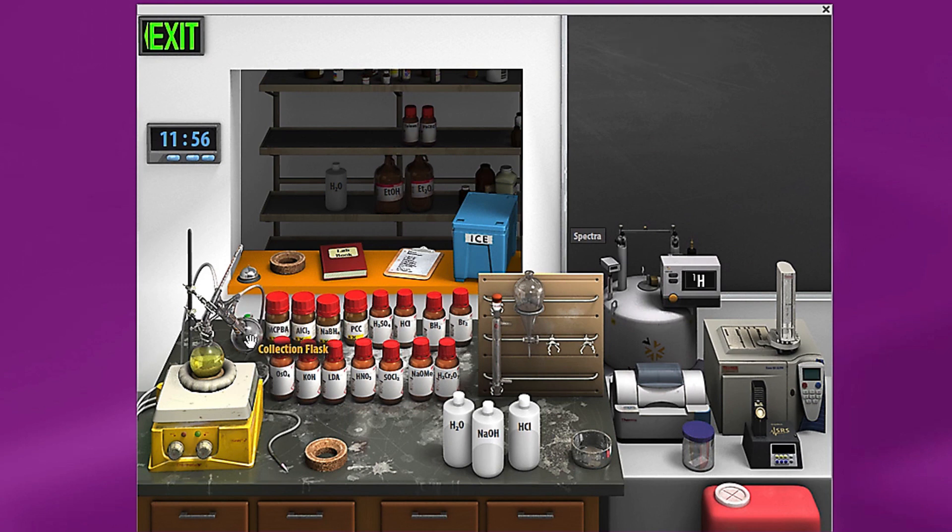This back here is your collection flask. Your products or different compounds that come off at different temperatures will collect back here based on their boiling points. That's how we're going to end up doing our separation. And then this right here is our regular distillation flask, which right now has all three products in it.